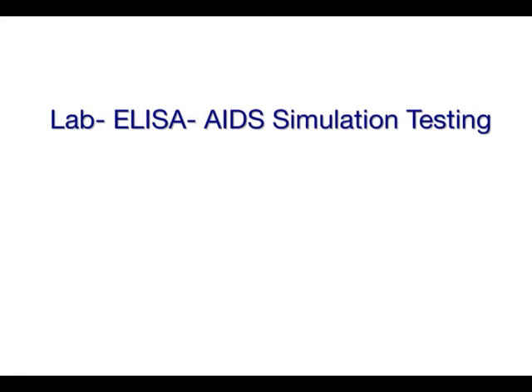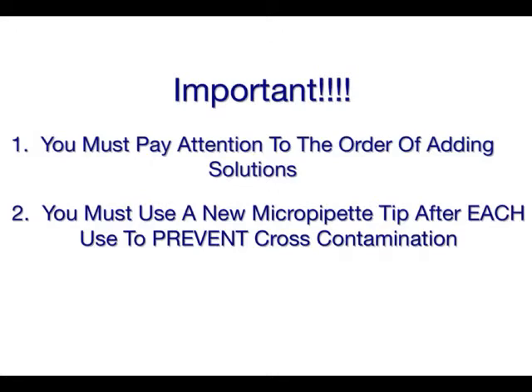The lab you are doing today is the ELISA test. Before you start the lab, it is important that you pay attention to the order of adding solutions. You also must use a new micropipette tip after each use to prevent cross-contamination.